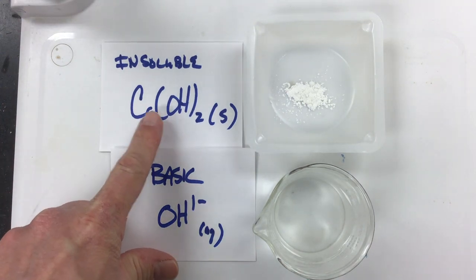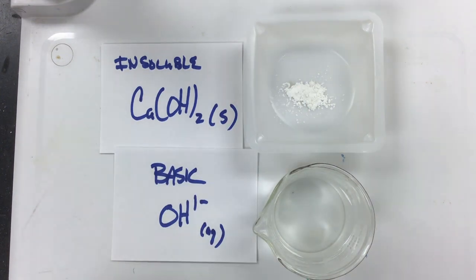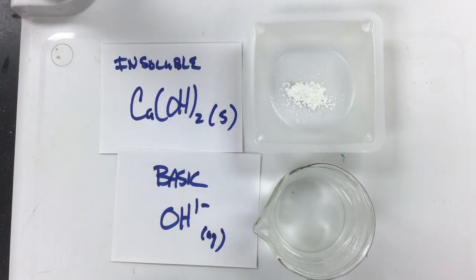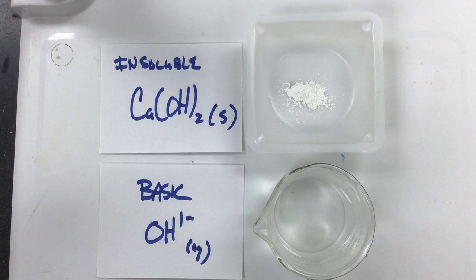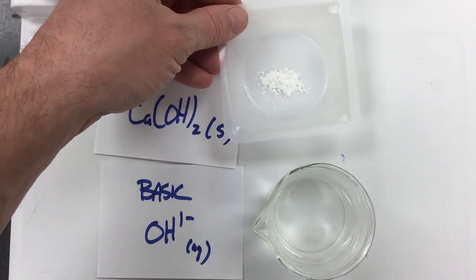So calcium hydroxide is Ca(OH)2, and it's a solid white powder as you can see here. It is insoluble, which is why we're trying to get a KSP value for it. Remember that if you have a soluble substance you can't get a KSP value for it. It doesn't work. It only works for insoluble substances.